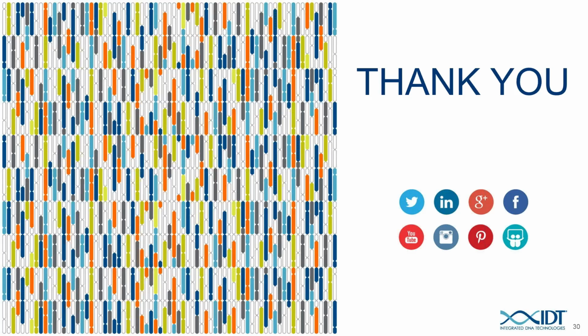We're still studying that, and I can hopefully have that included in some future online material, but it does seem like there is, I'd say, a minimum of about a 20 base space necessity to make sure that both RNP molecules can fit into that space and induce the break.